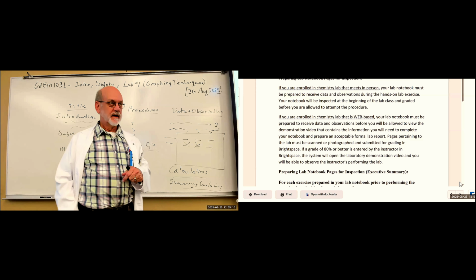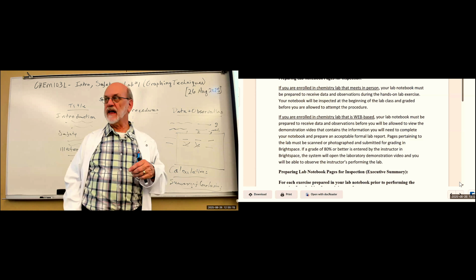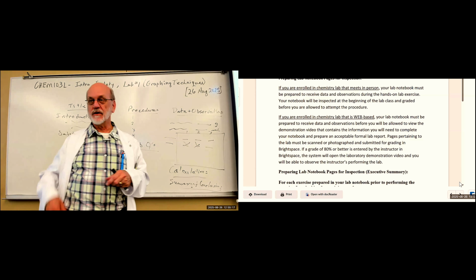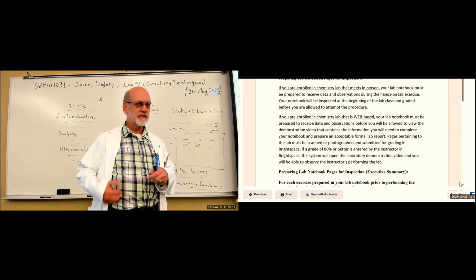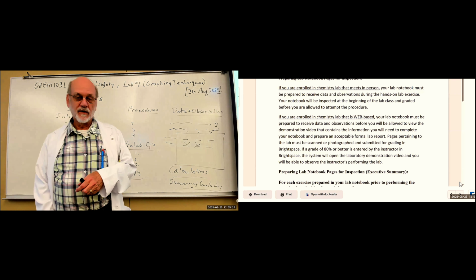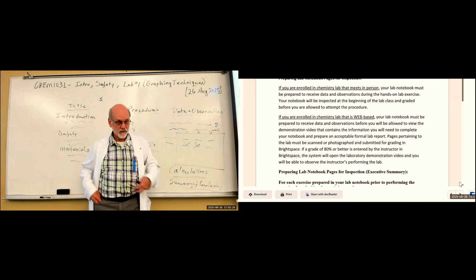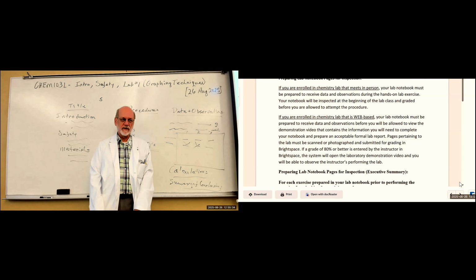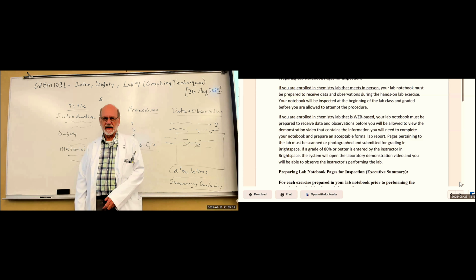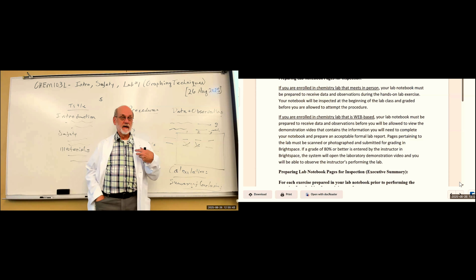Bunsen burner. Has everybody used a Bunsen burner before? Maybe, maybe not. That's an open flame. You don't want your hair flopping around, ready to go through the flame. Loose clothes too. Or later on, what if you spill something that's corrosive? You want to have a lab coat, you want your legs covered, you want solid shoes, preferably leather, but fabric's okay. Something you can get in and out of real quick. You want to protect every part of your body.